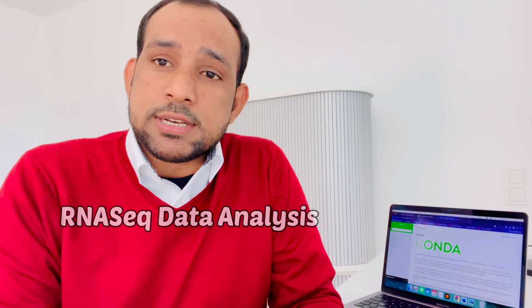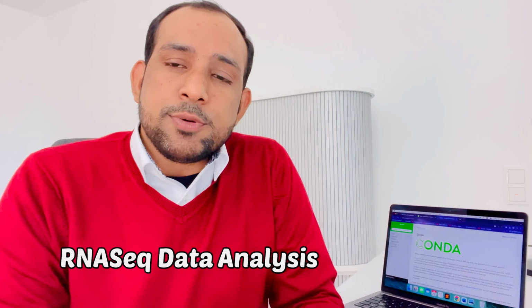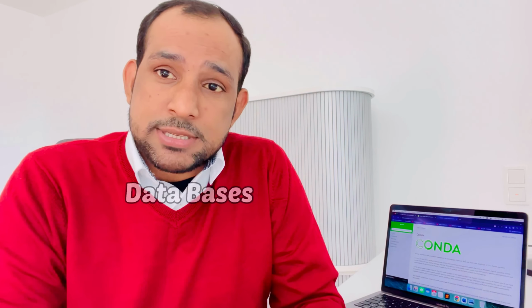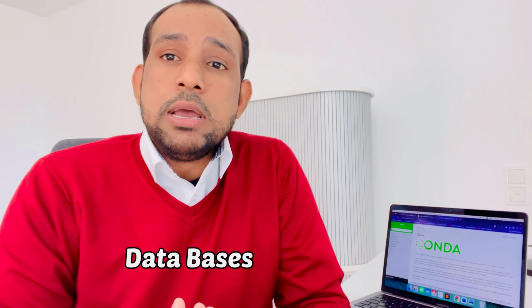Hello, welcome back to the second part of the RNA sequencing data analysis workflow tutorial. In this video, I will discuss the different available databases where you can freely download sequencing data and perform sequencing data analysis workflows. First of all, I would like to talk about the NCBI.